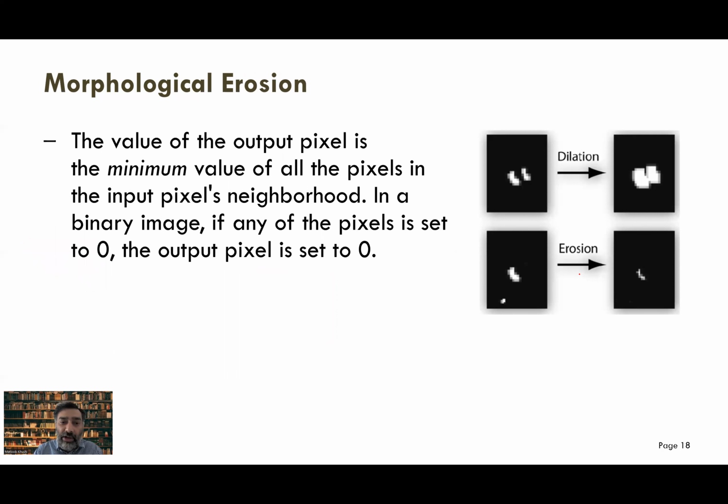On the other hand, erosion is an opposite operation where you're making things smaller, eroding. So it's the same. It looks at the neighboring window and neighboring pixel. And if the neighboring pixel is 0 in your structuring element, it makes that pixel 0 as well.